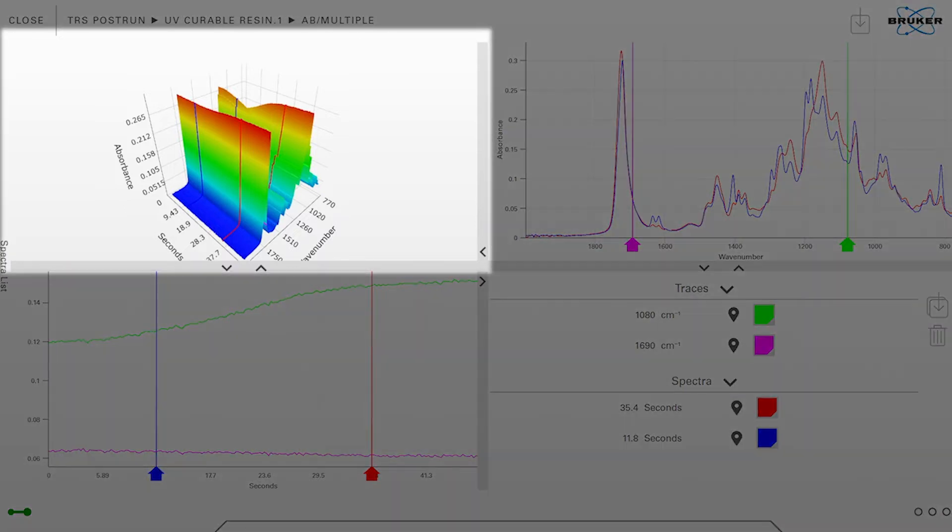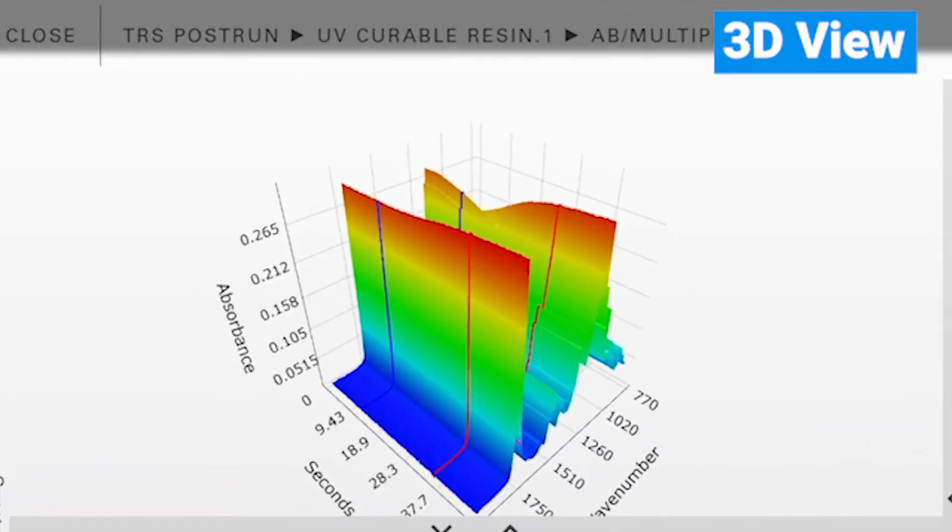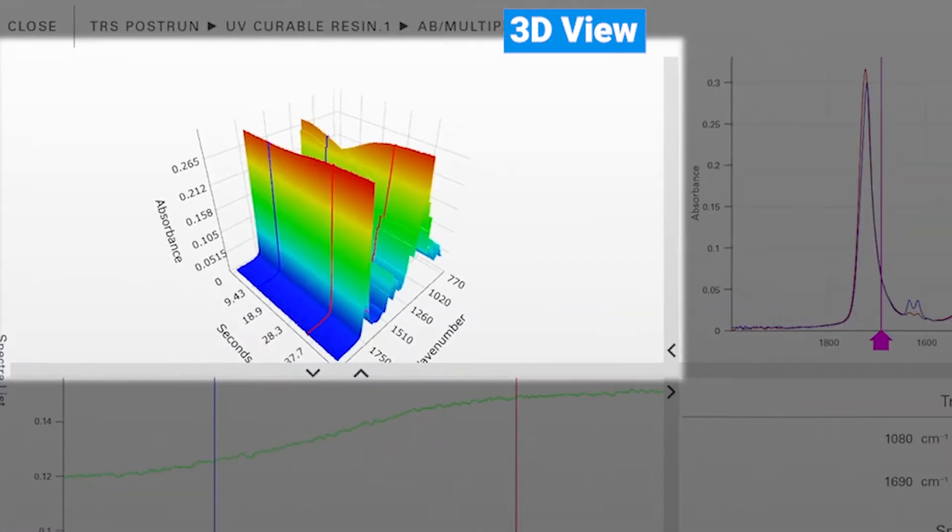In the upper left corner you can see a 3D plot which shows time-dependent information of our spectra.